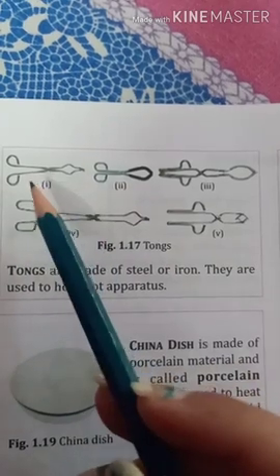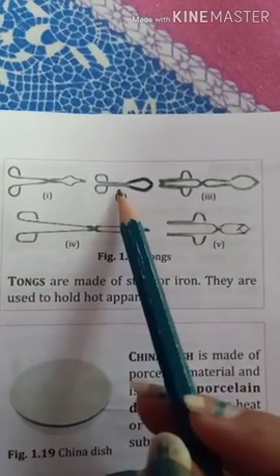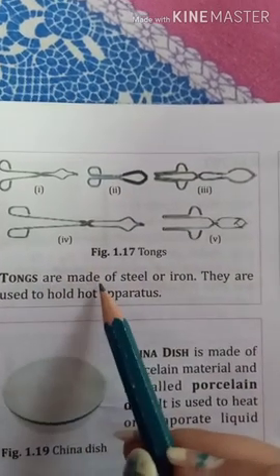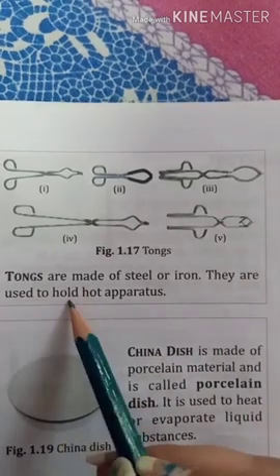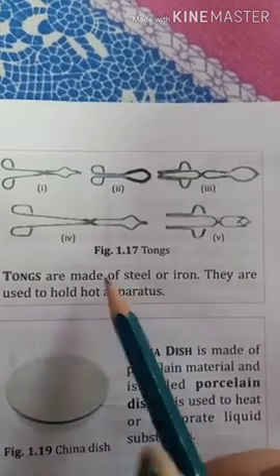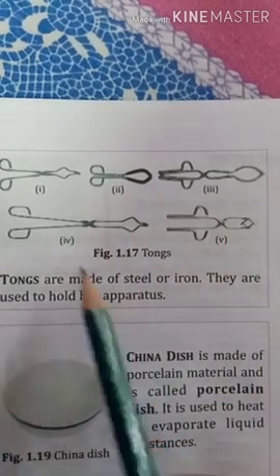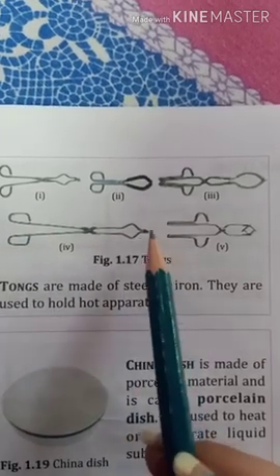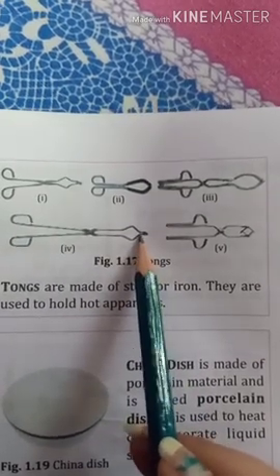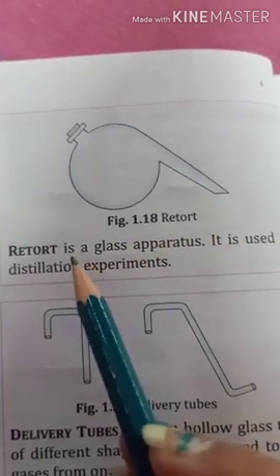Now here we have tongs of different shapes and sizes, and these tongs are made up of steel or iron, and they are used to hold hot apparatus. From this side we will hold the tong in our hand, and from this side we will hold our hot apparatus.